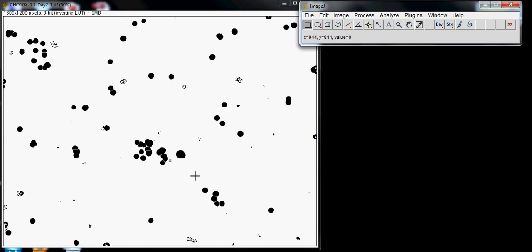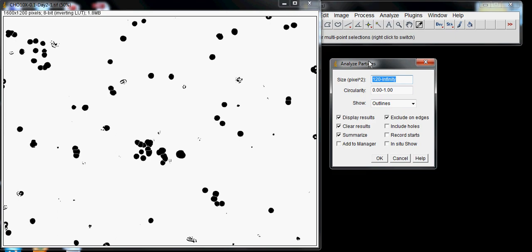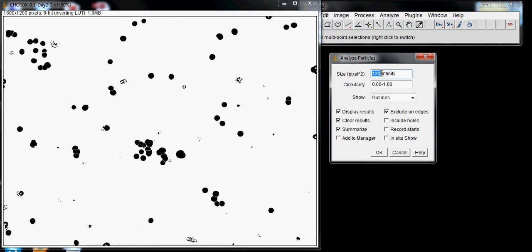This separates the images of what we want to see. You might be wondering if small data points will mess up our results. When we go to Analyze, Analyze Particles, the size parameter cancels out anything smaller than 120 squared pixels. You can adjust this number to fit your needs. I chose 120 and it works well.